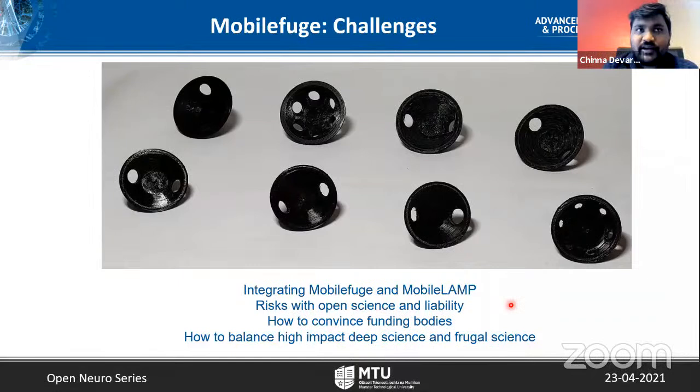Yeah, I had a call with Manu Prakash. He reached out to me. He's the one who developed the Handyfuge. He mentioned that the centrifuge is going to be the next big device, a critical device like his Foldscope. So he would like to make a network of people who are working on similar technologies. I'm looking forward to joining any such network. Yeah, that would amplify the impact of this work.